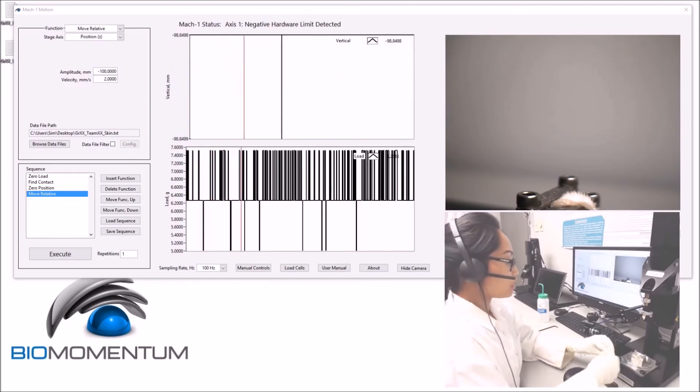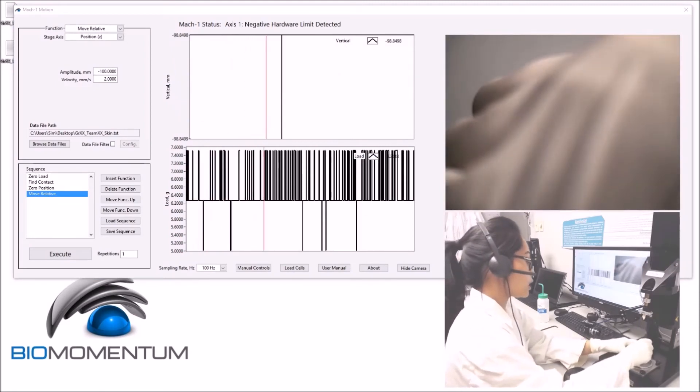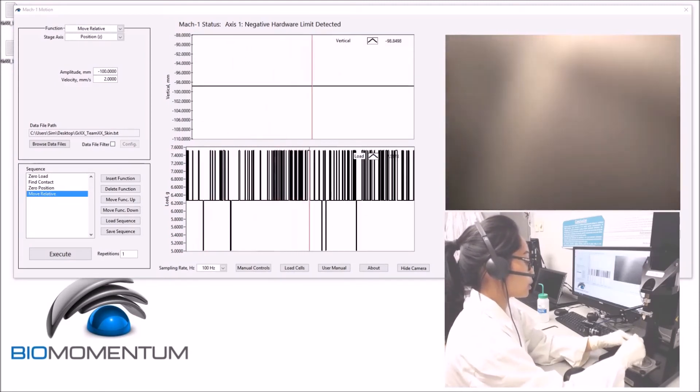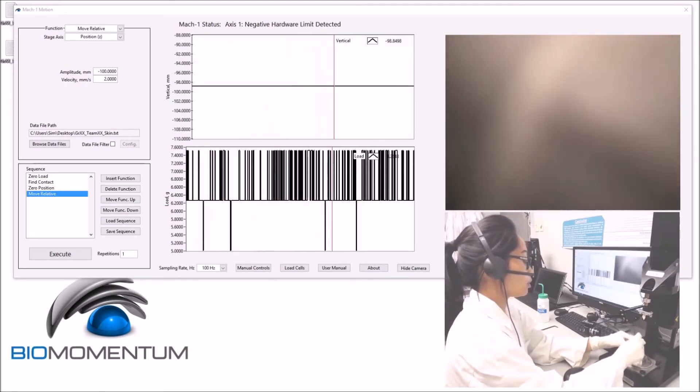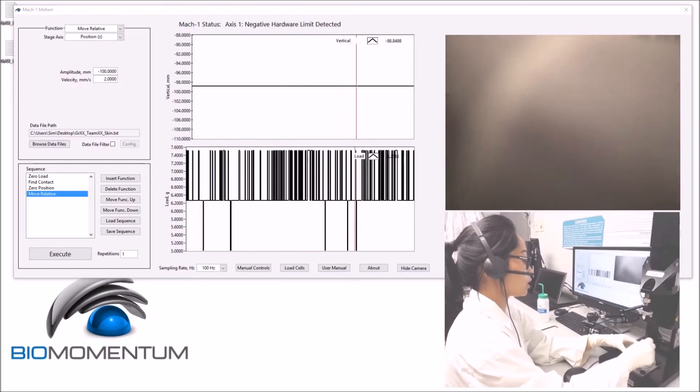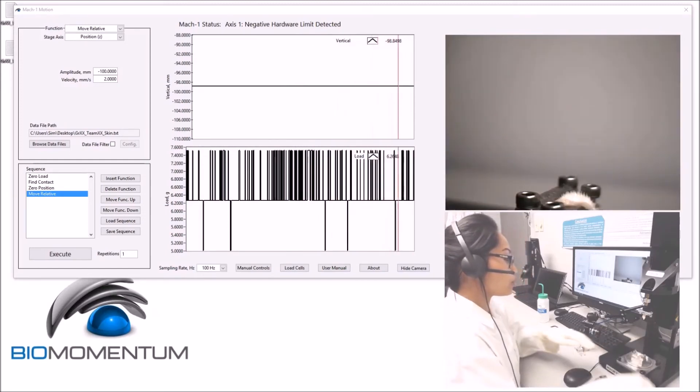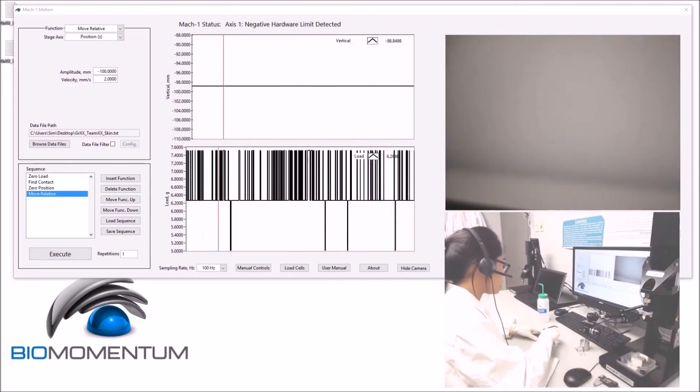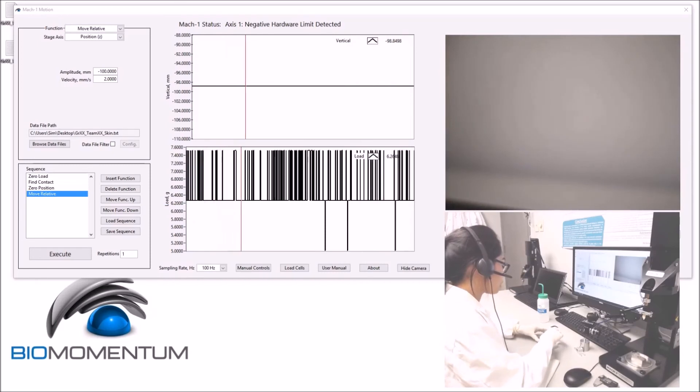Now let's remove the tensile grips from the sample holders.